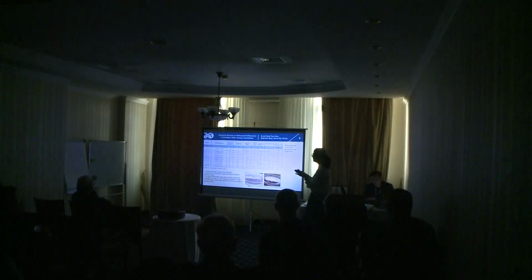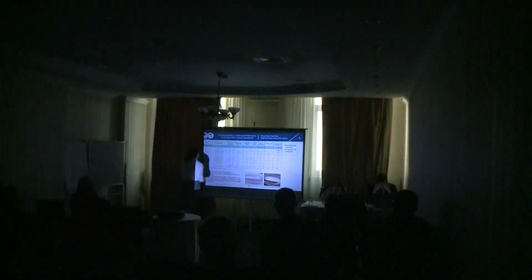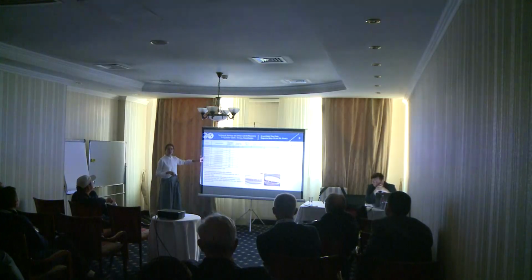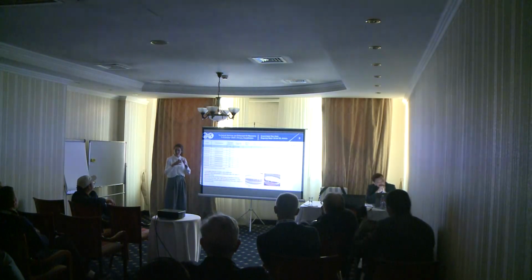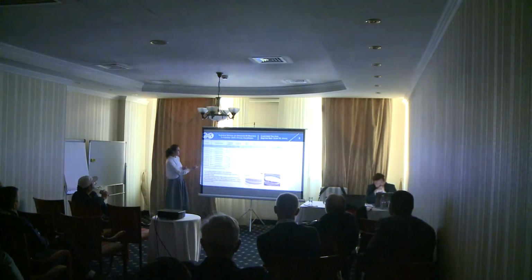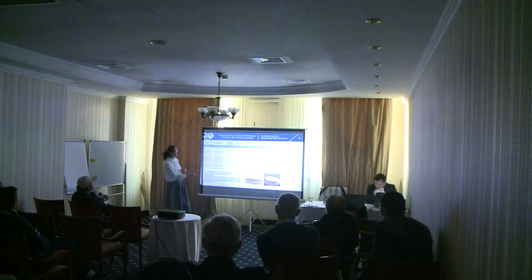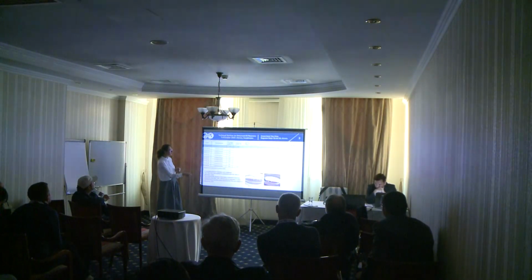Okay. So here is how we do our polymer selection tests. We order lots of polymers from different companies. Here we've got 9 polymer samples. As I told you, we do the identification of polymers. We describe how it looks, what the color is, what the main substance content is. We measure the viscosity, molecular weights, density, degree of hydrolysis, insolubles, how much we have there, and then the solution time.